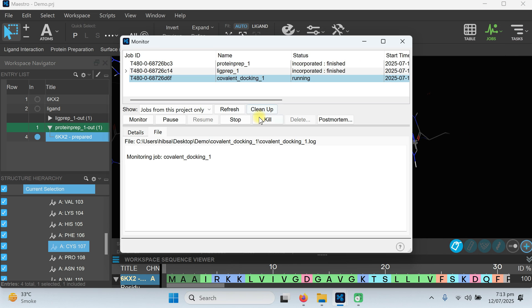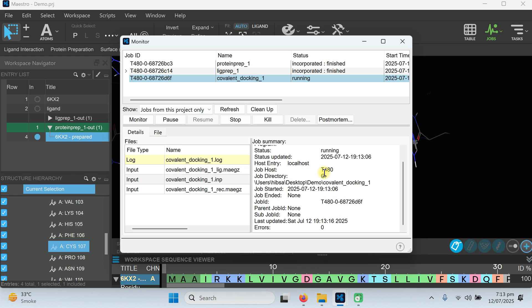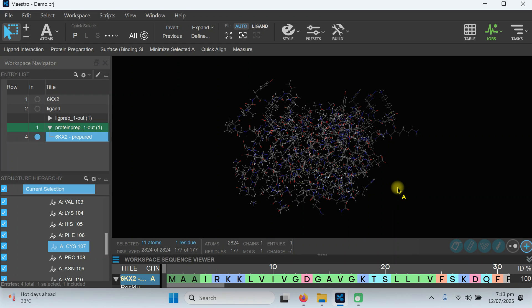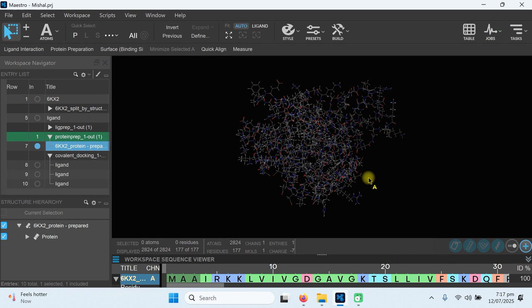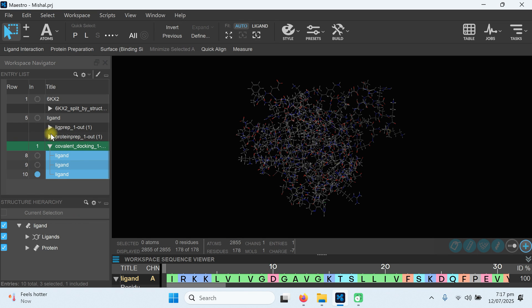Our job is running. Depending upon your computer speed, the size of the protein and the ligand, and the type of reaction, it may take 30 minutes up to 2 to 4 hours or even longer to complete. Our docking has been completed — you can see three poses have appeared.